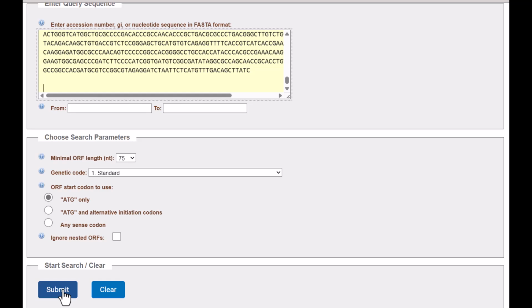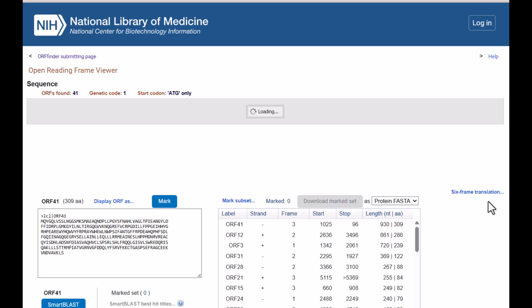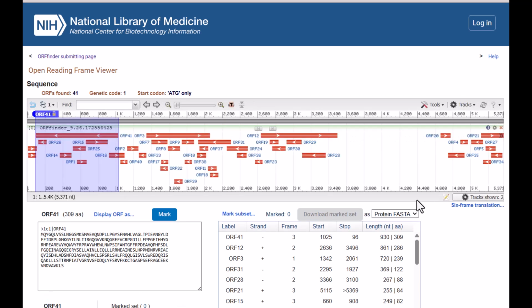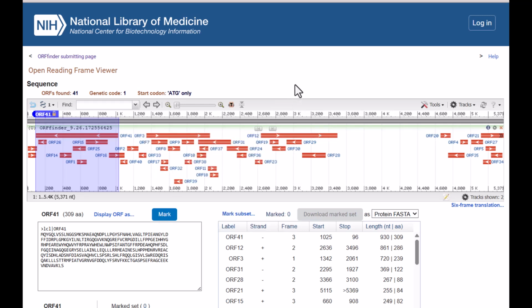You don't need to change any modifications, and it gives you a map of potential open reading frames. You can see these longer sequences in red, and these are the most likely areas that encode for genes. And as you've just seen, there are 3 different genes in that plasmid. The smaller reading frames are interrupted by stop codons, and they're too short to usually code for genes.